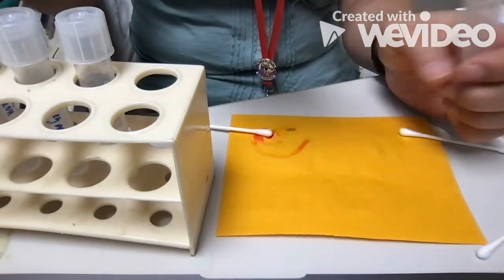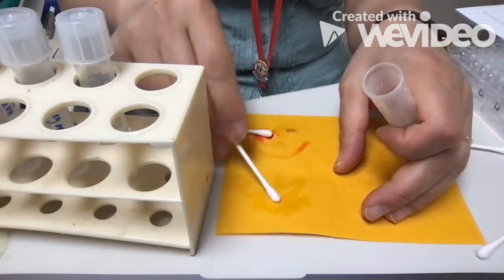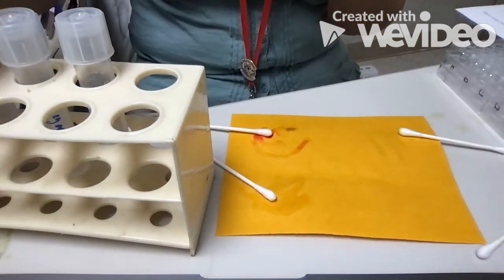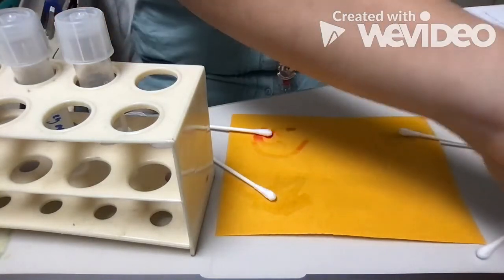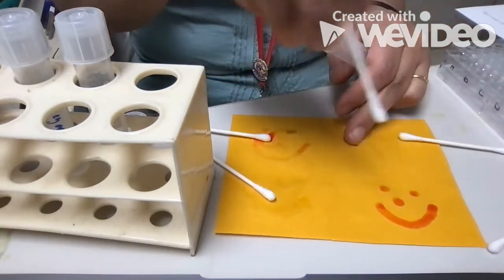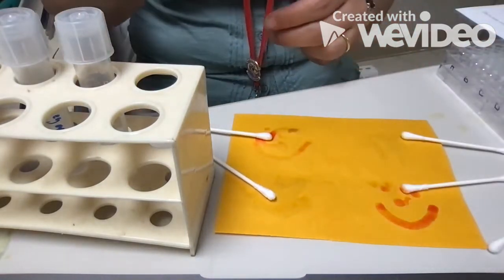Okay, so if I draw on this, again, the hydrochloric acid, there's no result. Maybe the paper gets a little bit yellow. And then finally, the last solution is NaOH. And you can see it's turning the same color as the ammonia.